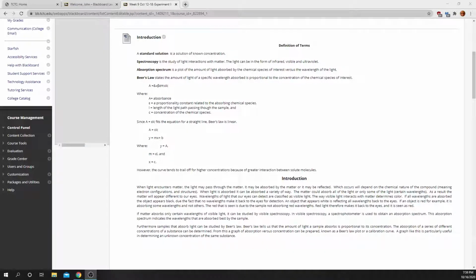All right. Okay. So, Beer's Law. You're going to be doing spectroscopy this time around. You're measuring light. Spectrum, light, scope is a device for measuring light. So, spectroscope. Spectroscopy is the act of doing the spectrum reading. So, you pass light through materials, and you can use the way the light interacts with the material to better understand the material or light.